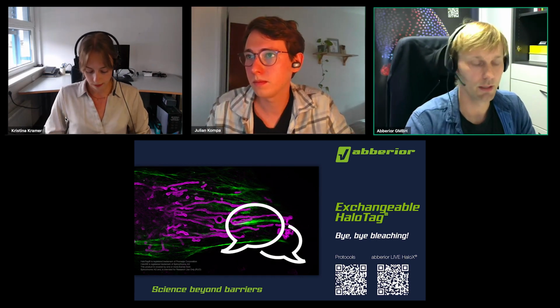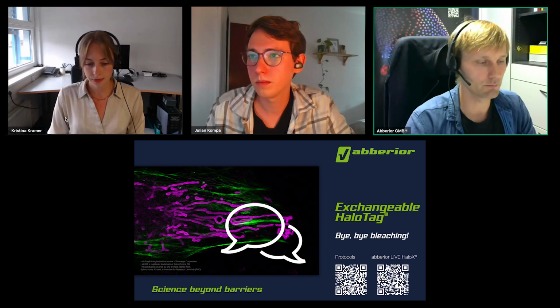Thank you. Another question to Florian. So what is the recommended working concentration of the live red labels that you presented in the beginning? And is there any information about the staining protocol or procedure? So to answer the second question right away, we have protocols on our website which you can download. There are also protocols for our antibodies, for other direct labels, for NHS ester, and so on. So you can go to our website, to our protocols, and then you will find also for HaloX and SnapTag the protocols.